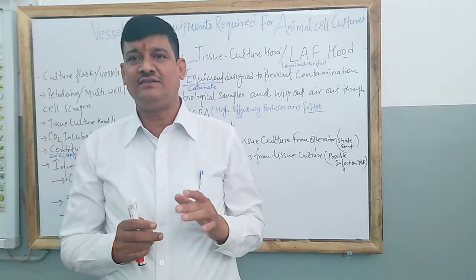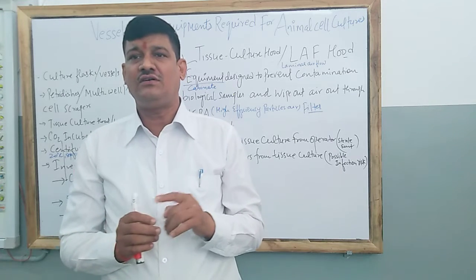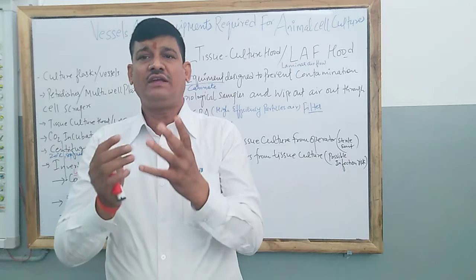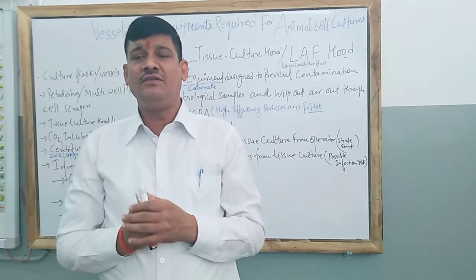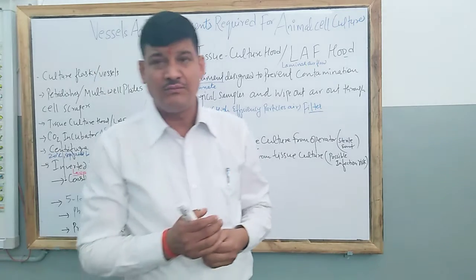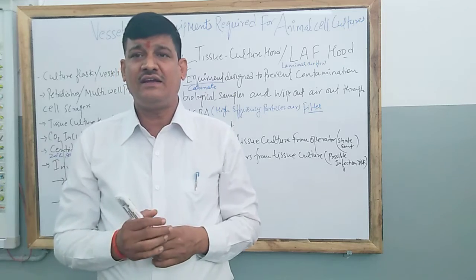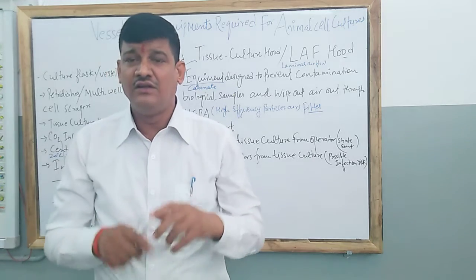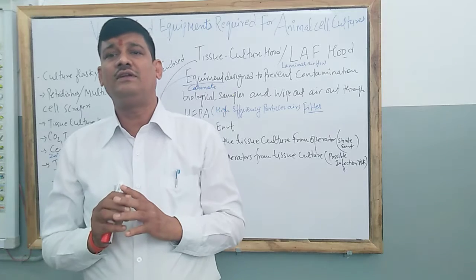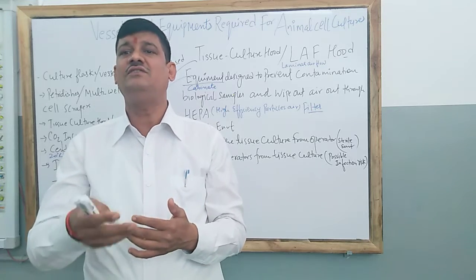It requires constant temperature and aseptic conditions, that is, a sterile medium without contamination or infection. And one of the more important things: if you are taking animal cells from warm-blooded animals, constant temperature should be given to the cells we are culturing. We also use 5% carbon dioxide along with a temperature of 37 degrees centigrade. This mixture of gas plus temperature is more suitable for culturing cells because our body temperature is in this range.